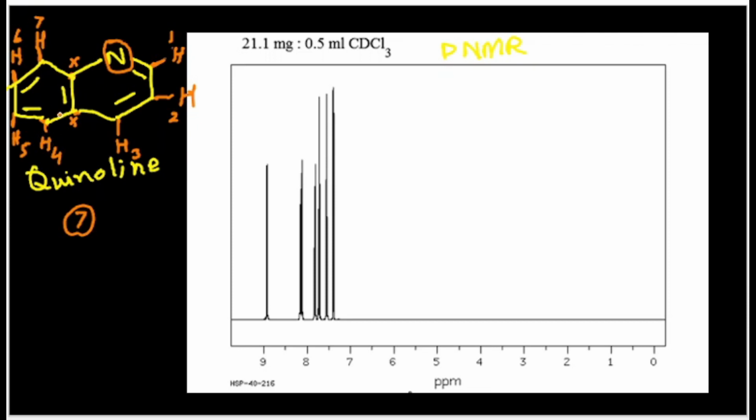So all these protons will not have exactly the same chemical shift value, but somehow they will have close chemical shift values. They will be very close together in the proton NMR, but not exactly the same, and will not show exactly the same peak with the same chemical shift value, which would give us an integration value of 2 or 3 for the same peak area.